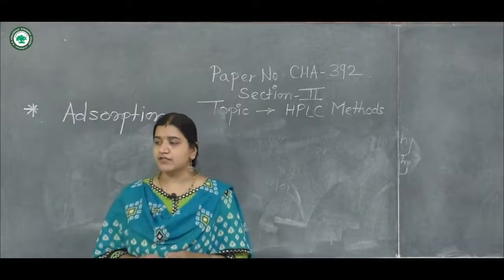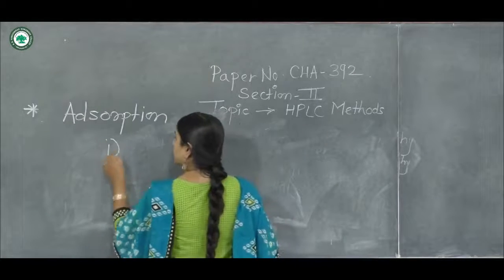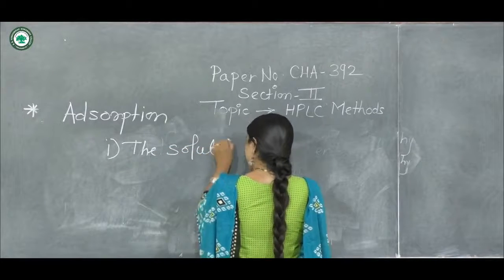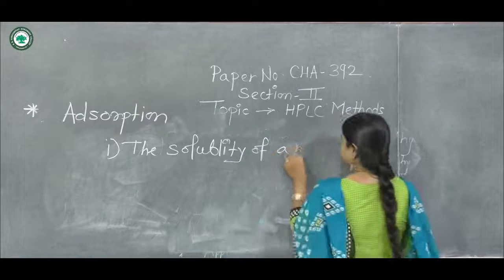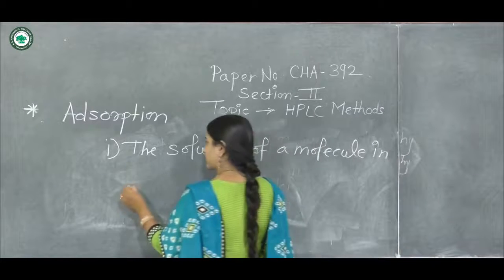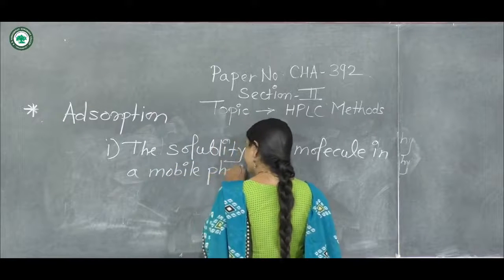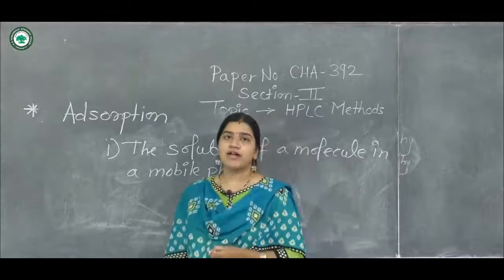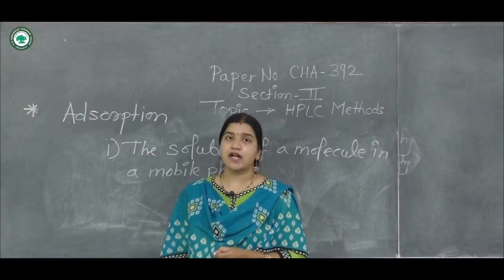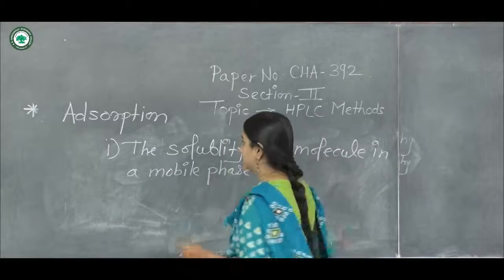The first factor is the solubility of your molecule of interest in the given mobile phase, and the second factor that will determine the separation is the binding strength of the stationary phase.